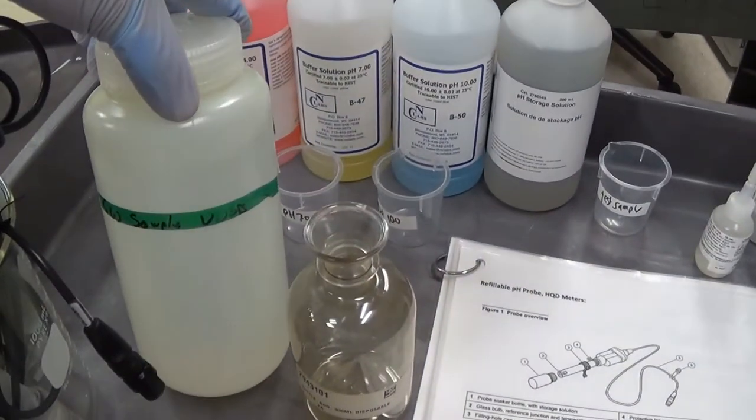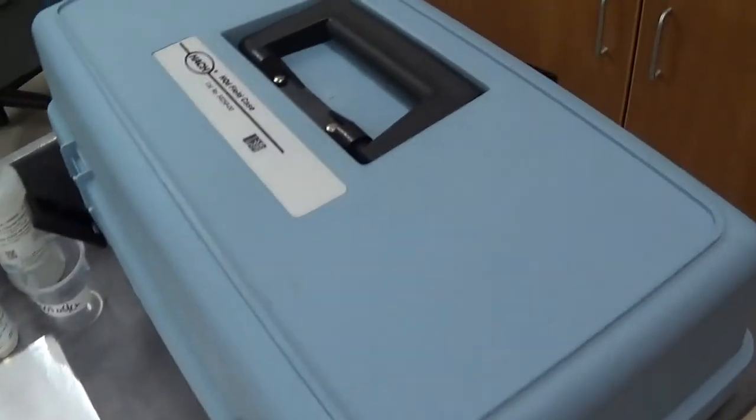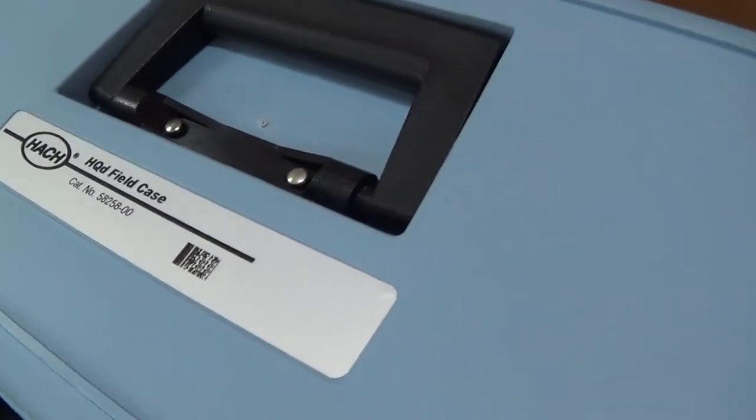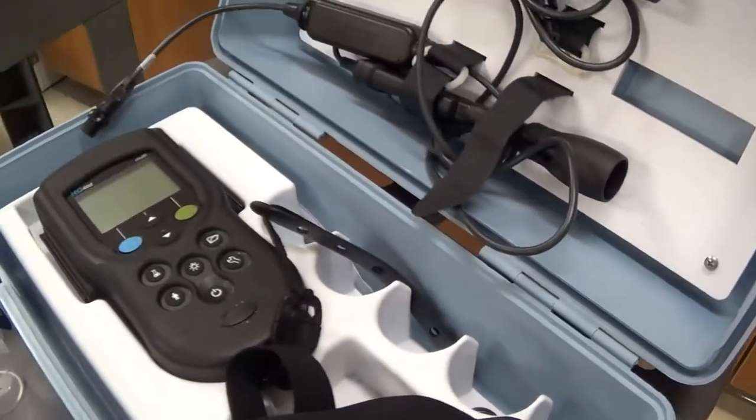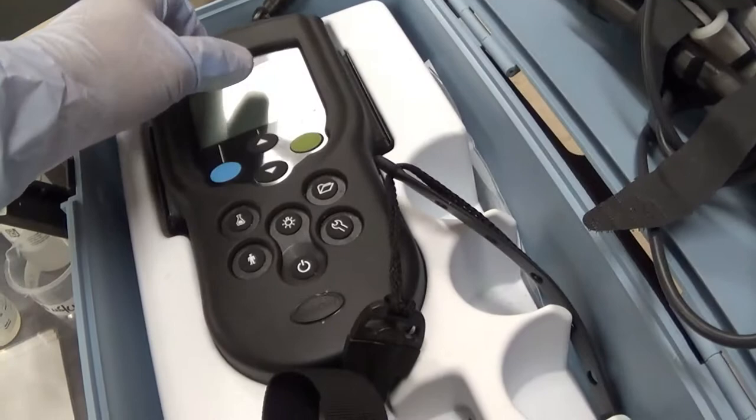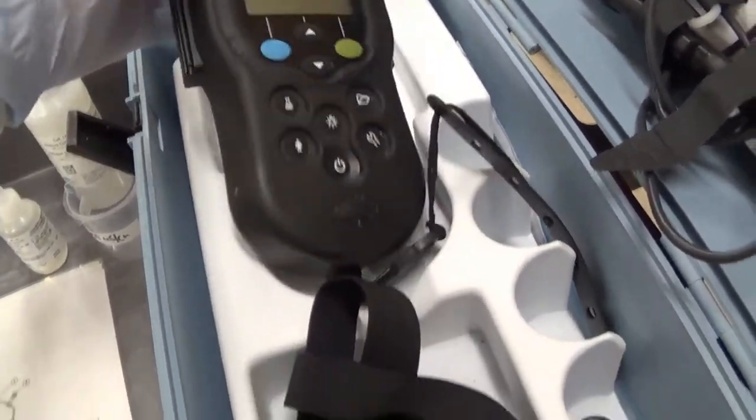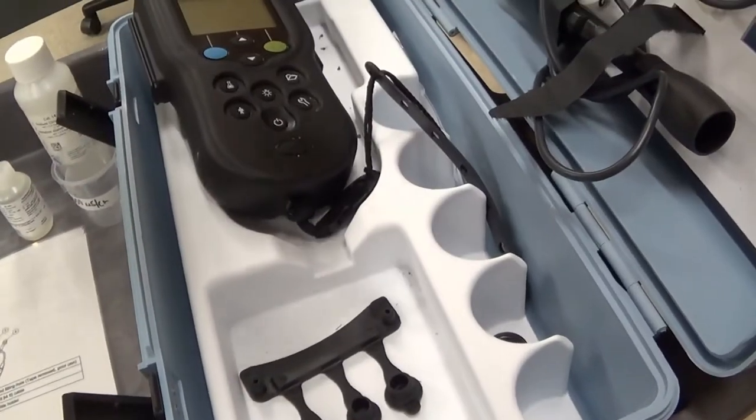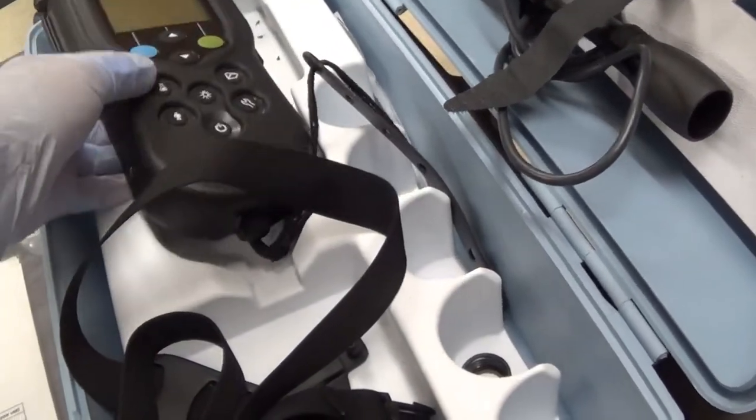We are going to test our well water from UWGB using our Hach field kit. This kit you would normally take with you to sample. The kit comes with a meter in a nice protective case, and different straps you can use if you are out in the field.